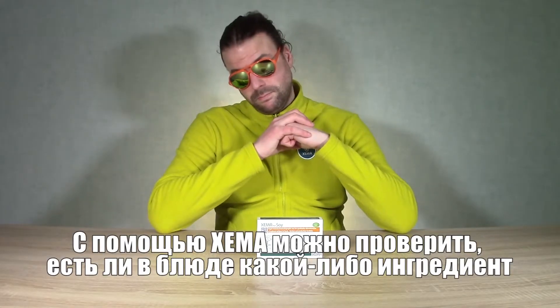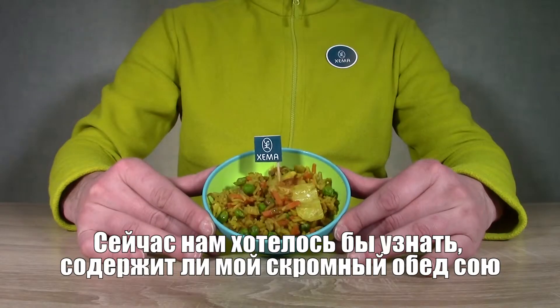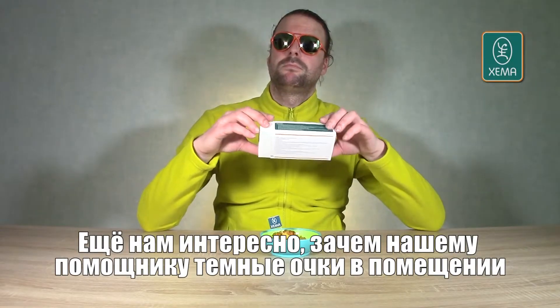With XEMA Test it is possible to test food for specific ingredients. Right now we are wondering if this tiny dinner contains soy. We are also wondering why our test person is wearing sunglasses inside.